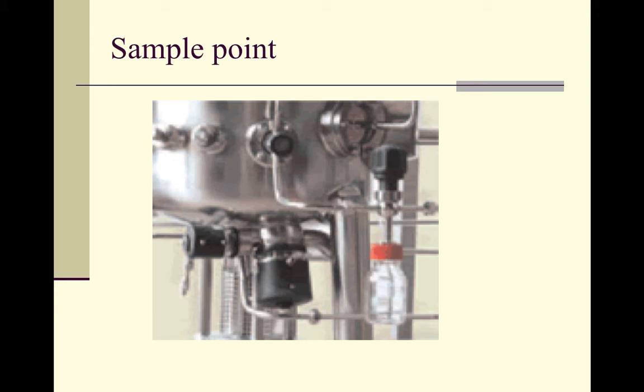There are a lot of ports attached to the fermenter vessel, usually at the sides and the bottom part of the fermenter. And these ports are usually sample ports which help one to remove the sample to check for the amount of the end product, the pH, and the concentration of a certain ingredient that is available at a certain point, and most importantly to look for contamination. The bottom of the tank is also used to retrieve the culture medium after the fermentation is over. There is also a weighing cell that is placed at the bottom of the tank.